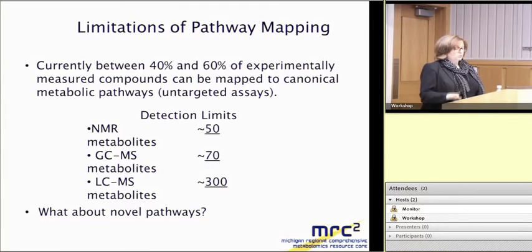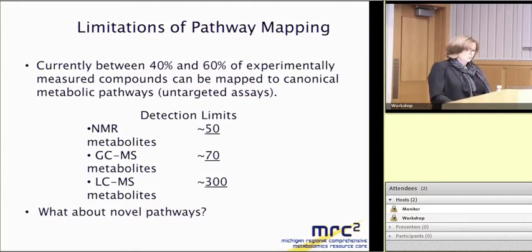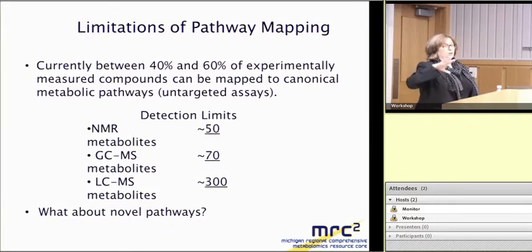For the untargeted study, even if you're doing a study in human, remember we have human metabolic networks here. But you're also likely to see nutritional compounds, various compounds of environmental origin, compounds that come from the microbiome. Okay, and these would be bacterial metabolites that are not going to be part of human metabolic networks. That's one of the big limitations, right? And so going back to what Barbara described very well, this overall workflow and process: in essence, we're using prior knowledge to extend our understanding, explore our data, and put our data in the context of prior knowledge, right?